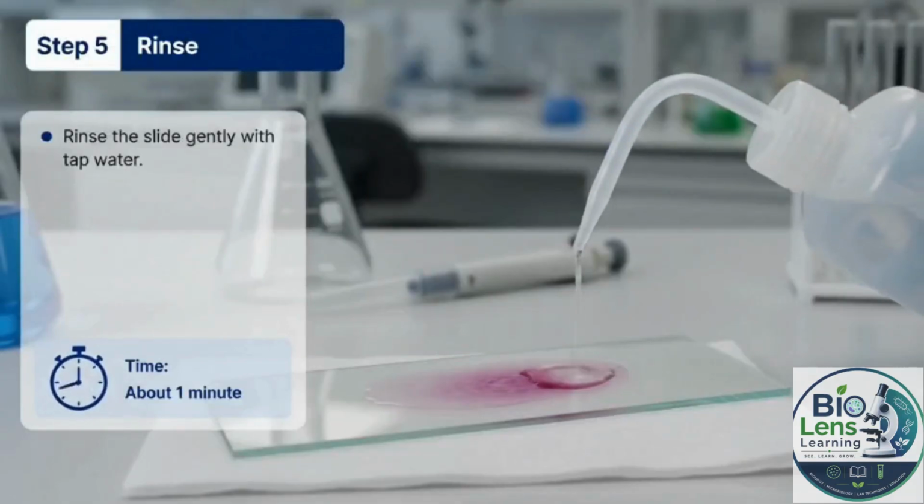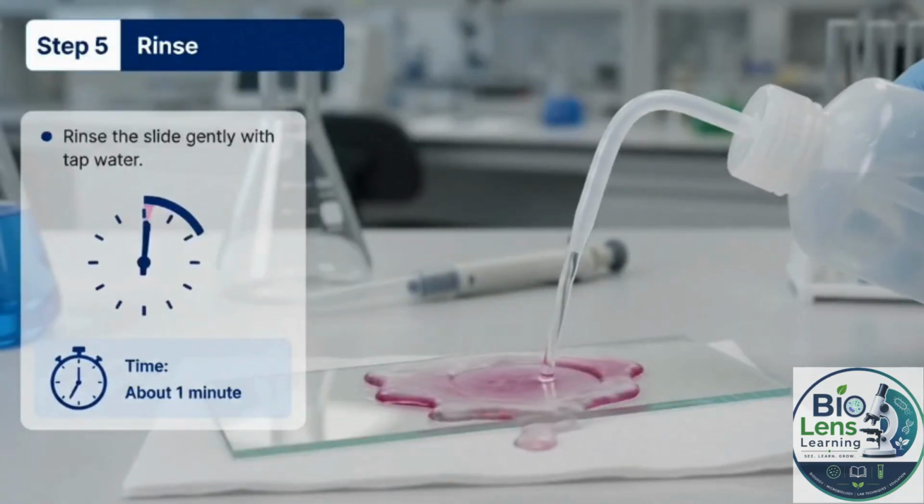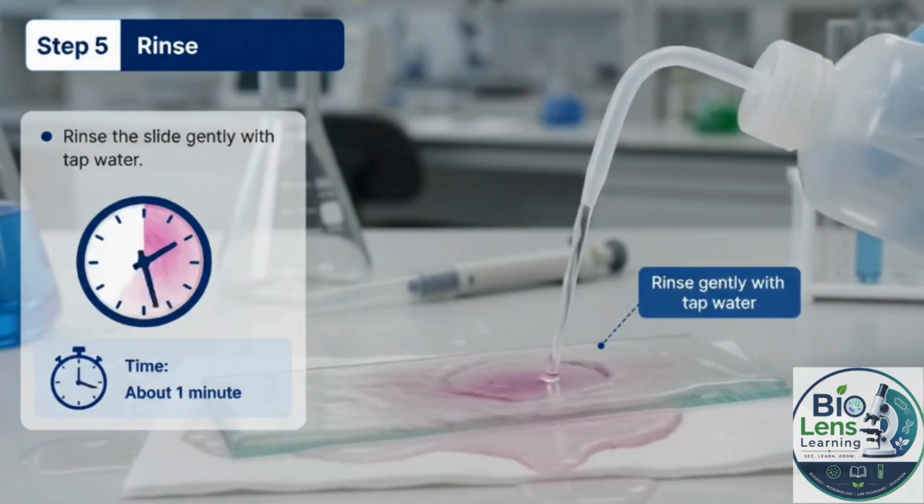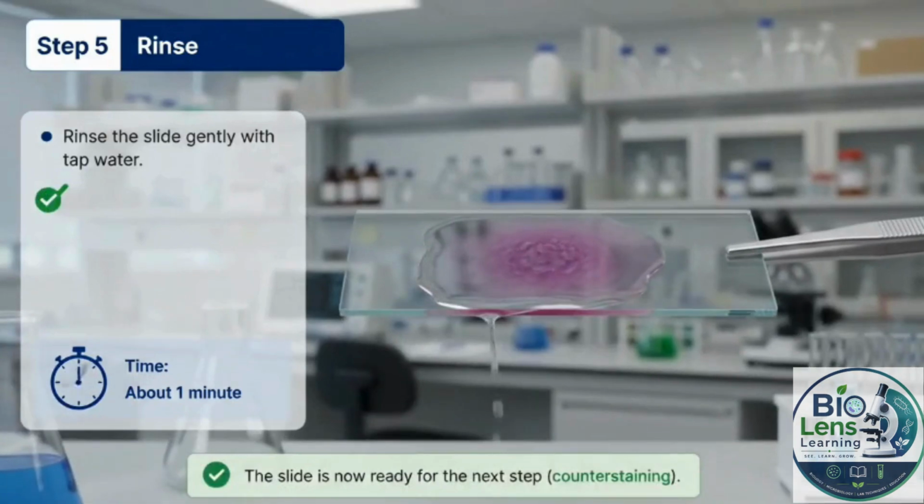Step 5. Rinse the slide gently with tap water. This should take about 1 minute. Rinsing removes the acid alcohol and stops decolorization. Now, we are ready for counterstaining.